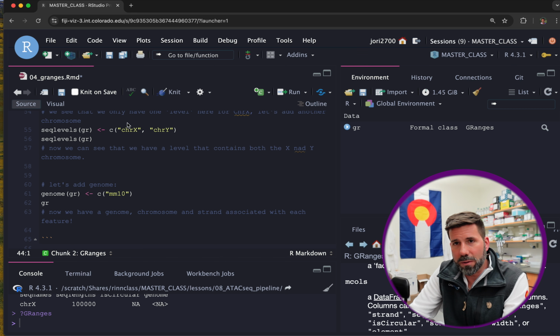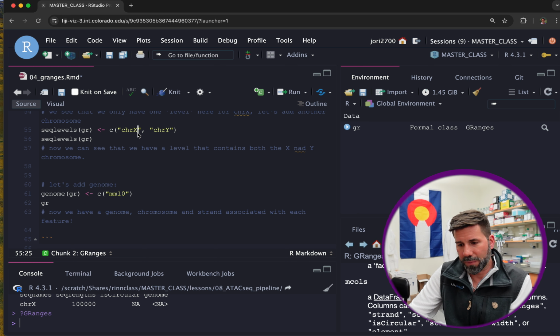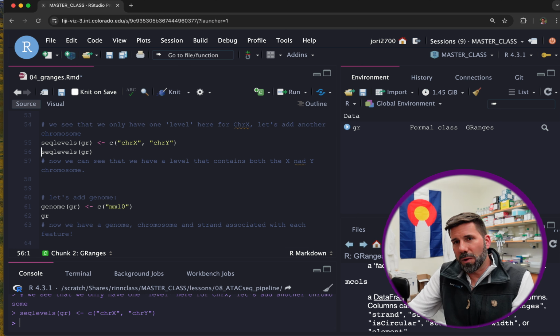Again, in videos I try and go a little faster just to conceptualize some of this stuff. Okay, so instead of adding each seq name for the chromosomes, we could do seq levels, and that would fill the chromosome spot for us. So we could just paste in as many chromosomes as we wanted to make.